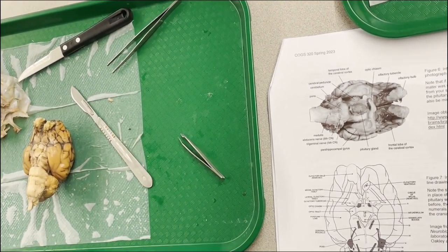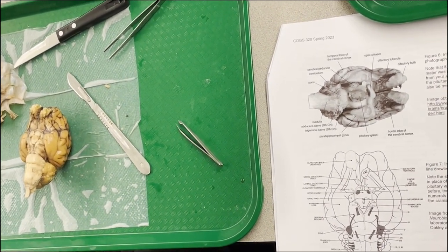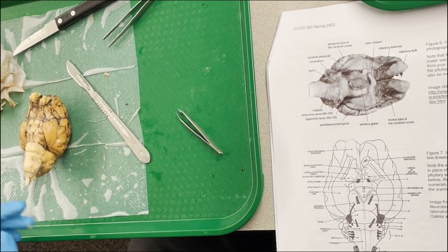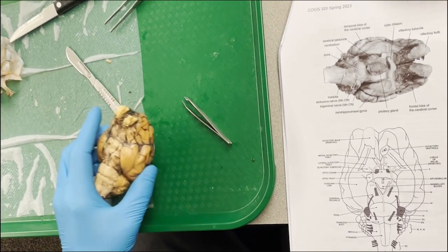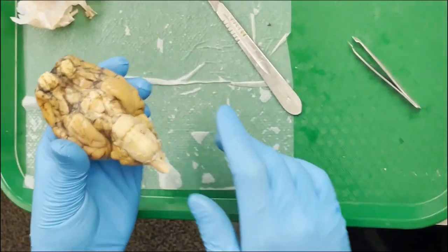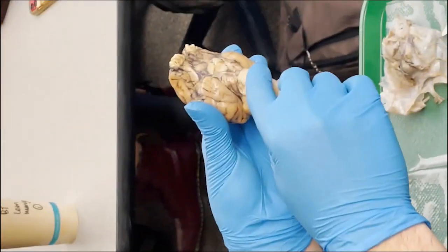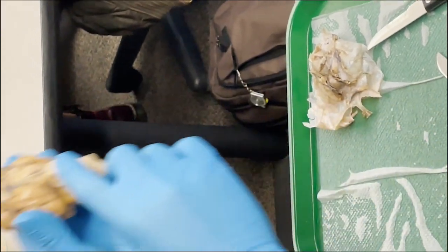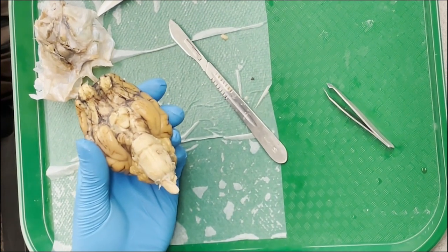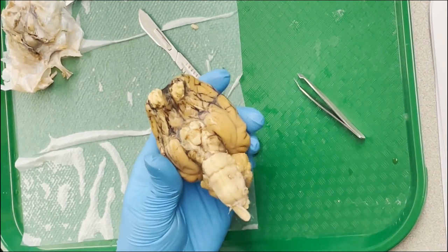There are other nerves that we've pulled off. For instance, a lot of you ended up cutting through nerve number 3 as we were removing the dura mater further back. Beyond that, we have other structures that we could see from the underside. For instance, the pons is actually pretty low down. It is one of these mounds that's toward the base of the brain. So we see pons sticking out here as far as the brainstem. Beyond that, we'll have the medulla. There'll be maybe more cranial nerves attached, maybe not. But these are pretty much the go-to things to look at.